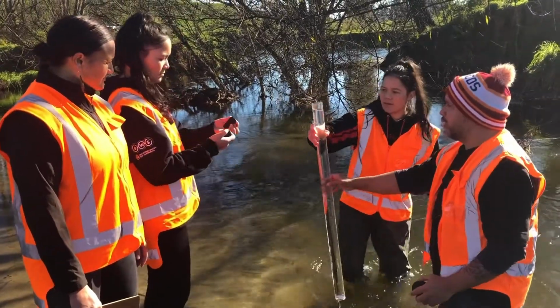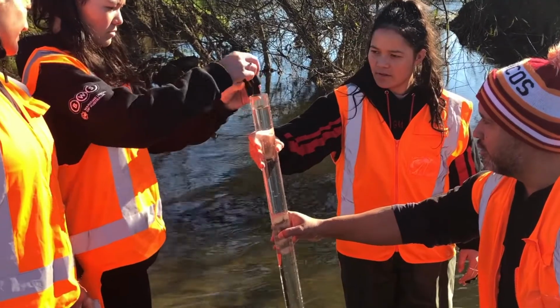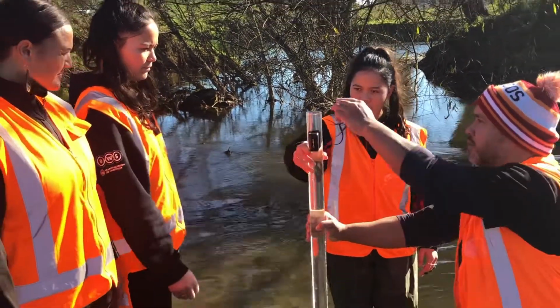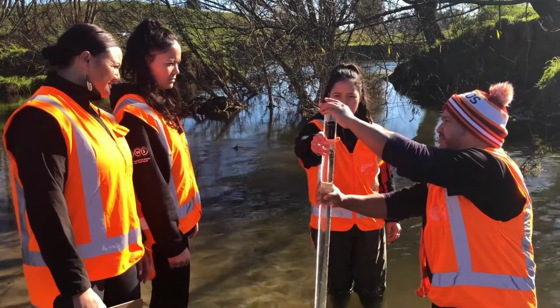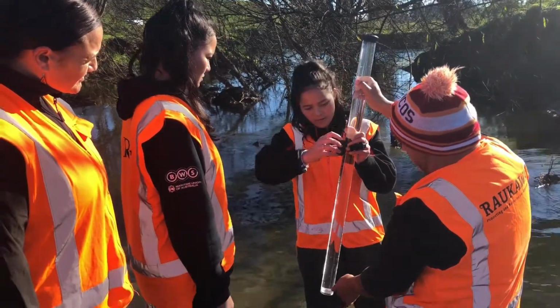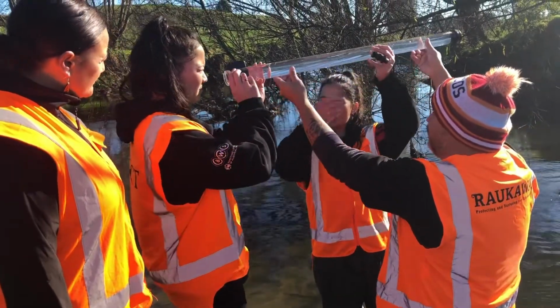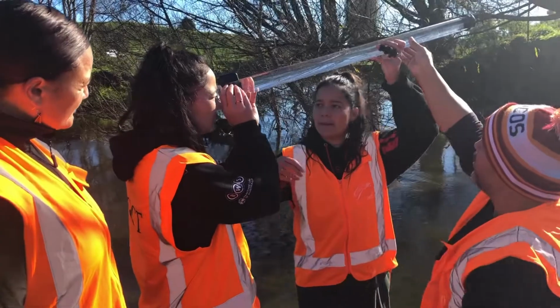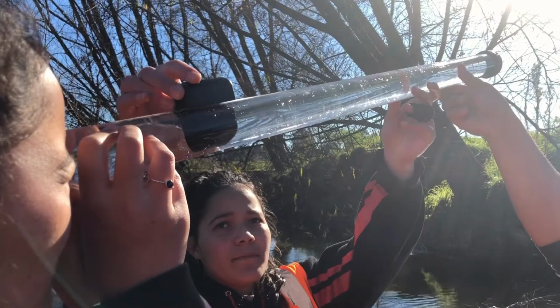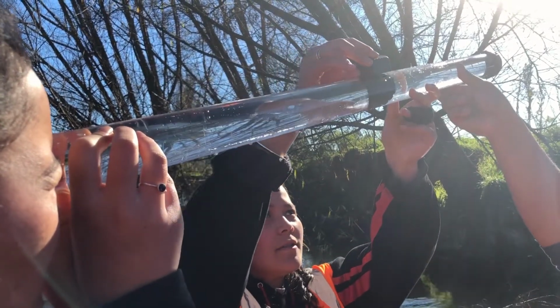Now we chuck our 2 magnets in, so if you chuck one on the inside, one on the outside. They'll hold. Yep, choice. Put our lid on. Pari, if you pull the magnets right down to the bottom here, choice. Now Te Ora, if you look through that bottom, what we're going to do, hold it up on a slight angle, and as we slide those magnets around up, Te Ora, if you tell Pari when you can't see the magnets anymore.